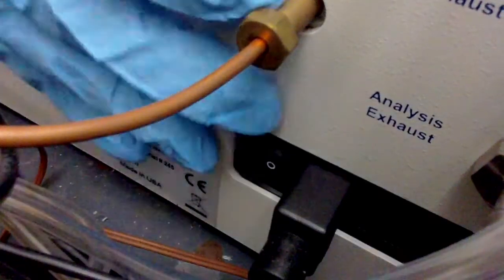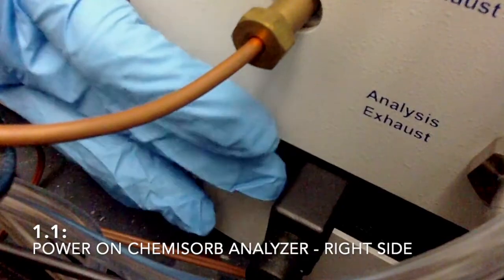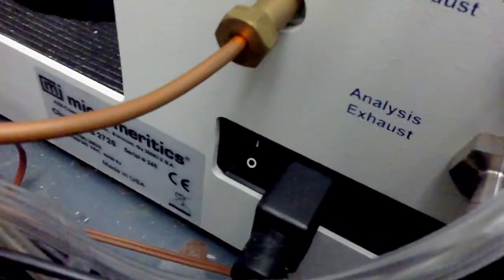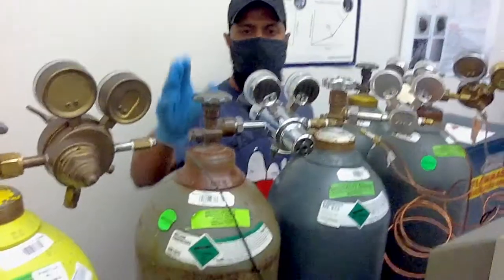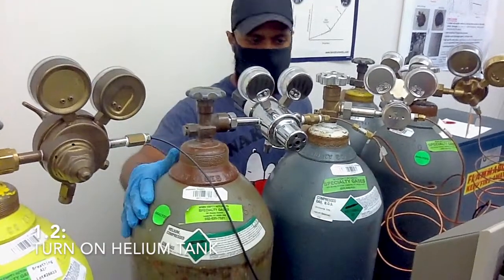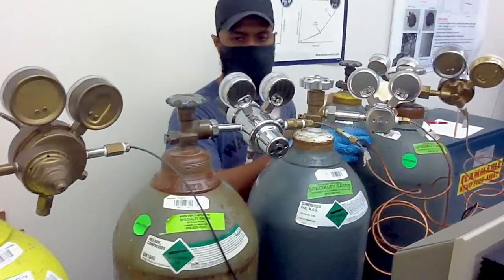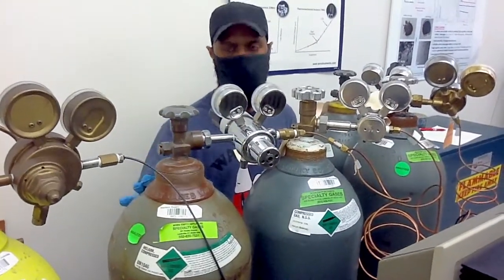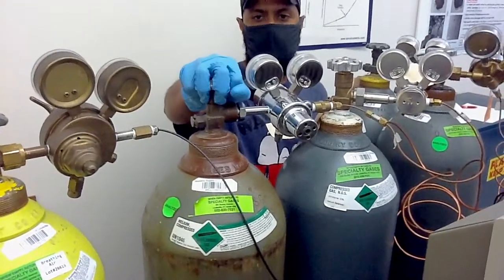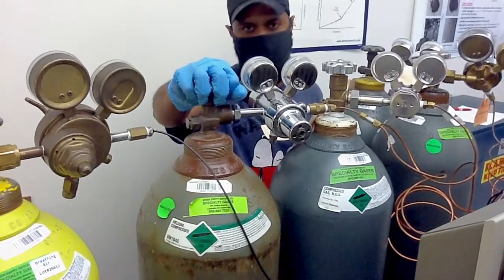So there is a power button we have to press before we start anything on this instrument. Press it, and the instrument turns on. To begin your experiment, you have to turn on this gas valve, which is for helium, and we have ammonia and other gases. For this experiment, we will be using helium at the beginning to prep the sample. So you will turn on just the tank valve.